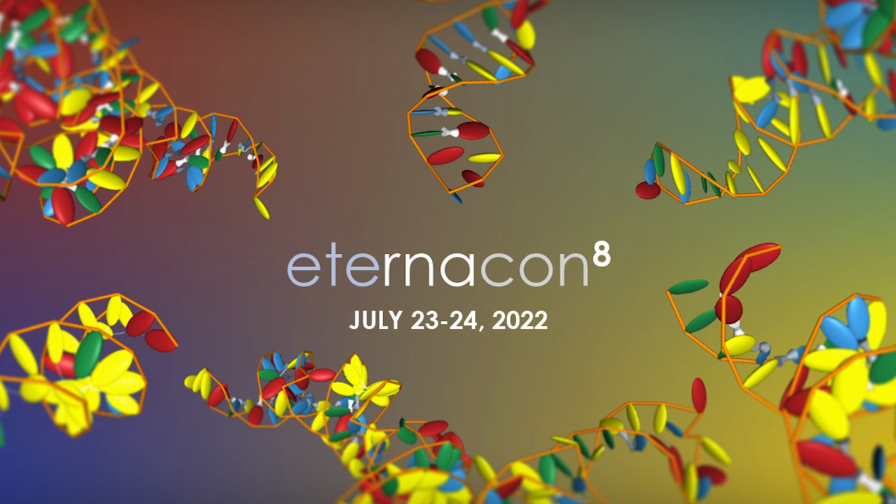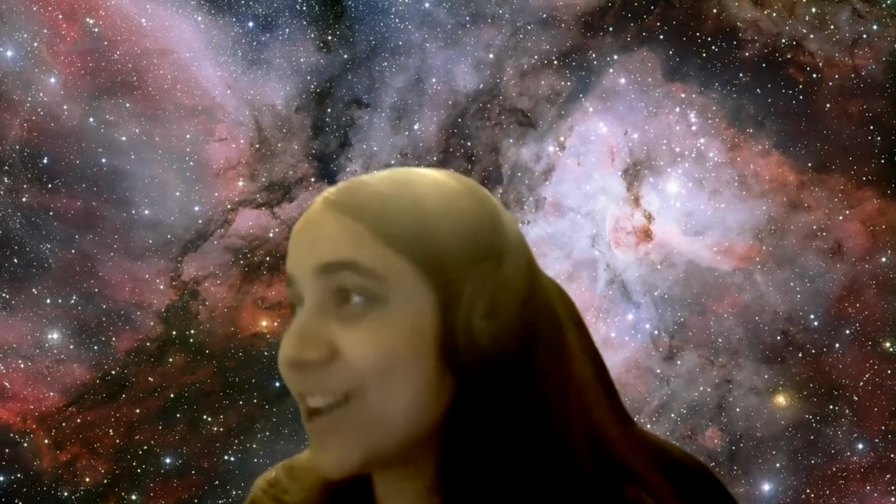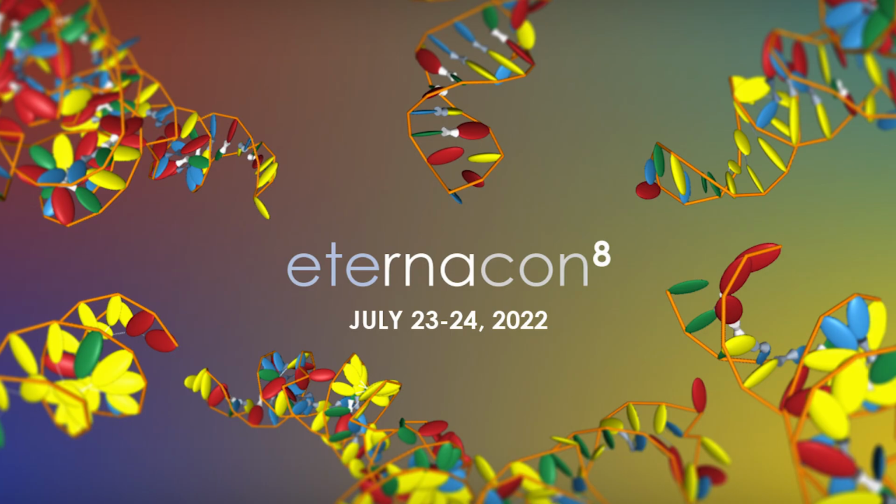Well, there are other commands that I find very useful. For example, rather than actually deleting things, you can simply choose not to display them. Oh, interesting. What's the command for that? That's different than deleting, and it's different than making it transparent. There's one just for whether I want to display something or not.